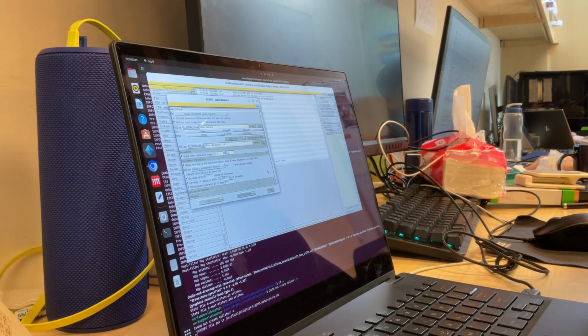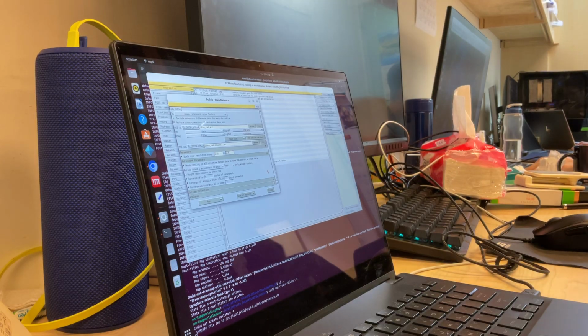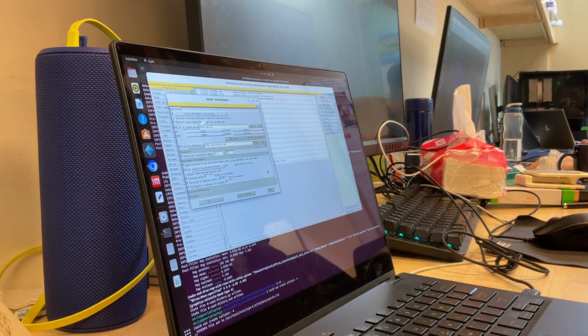The reason is that the data that is too far out, so too low resolution, is very, very strong. So if you include it, it can dominate the scaling of everything. And because it's very strong, it may actually be close to the saturation of your detector, and therefore may underrepresent what the actual value should be. You see what I mean?